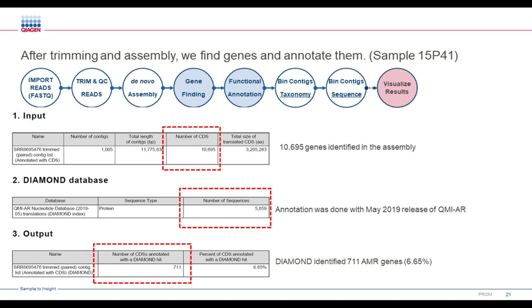It's not really the same as BLAST, but it's a close approximation of the way BLAST works. And the main advantage of the Diamond algorithm is that it's extremely fast, and you can provide it with a gene database of your own design and use it to annotate open reading frames, CDS sequences, et cetera, in a reference genome, or in this case, a de novo assembled genome in which the genes were predicted.